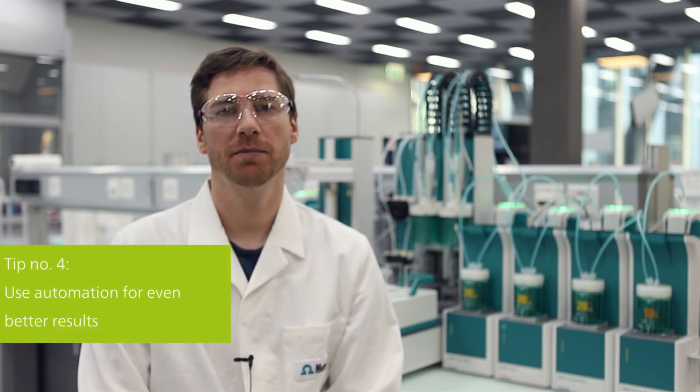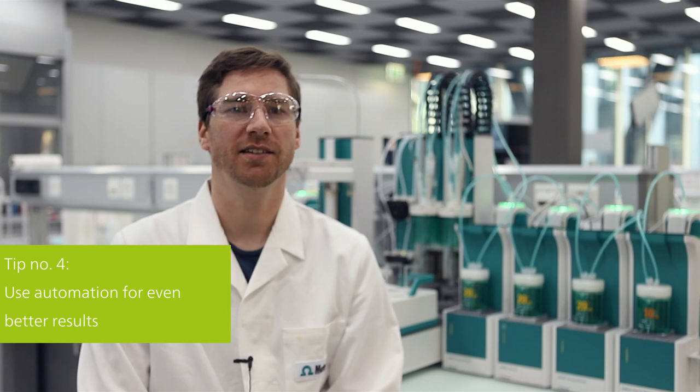The three tips I just gave you are crucial to improve accuracy and reproducibility of your acid number results. My tip number four is just the icing on the cake.